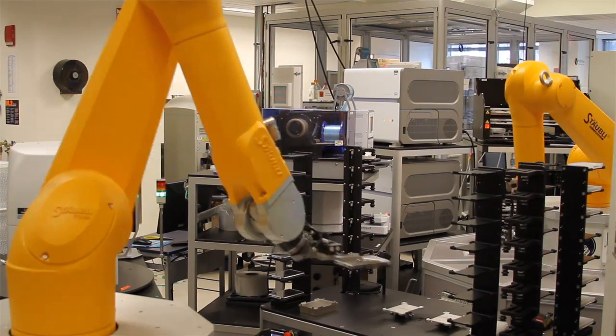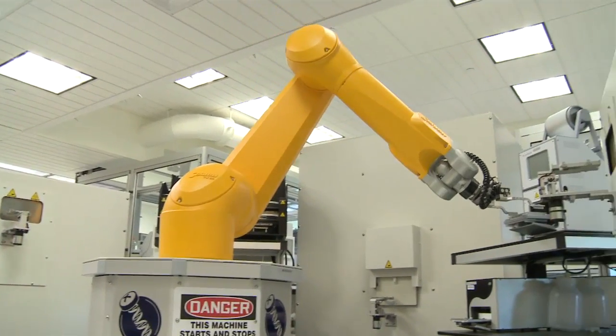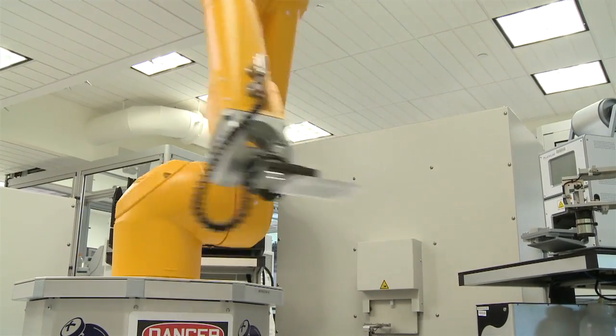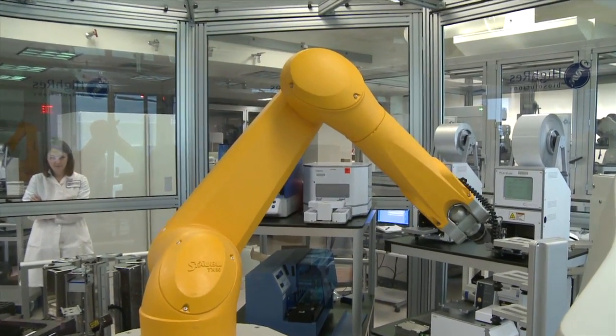Scientists use machines like these robots you see here to speed up the process and keep the experiment as precise and consistent as possible. In these experiments, we use plastic plates containing hundreds of wells or tiny tubes. We put a different chemical into each well of the dish. We then add the protein we want to target into every well of the plate.